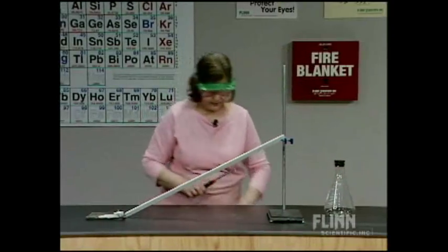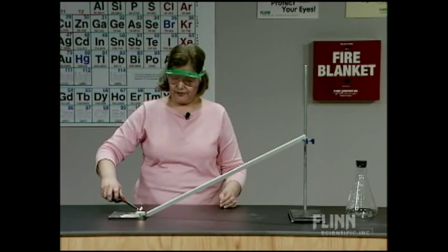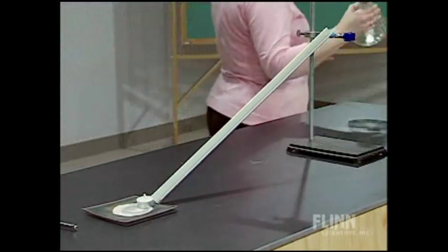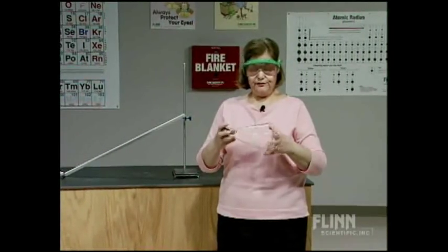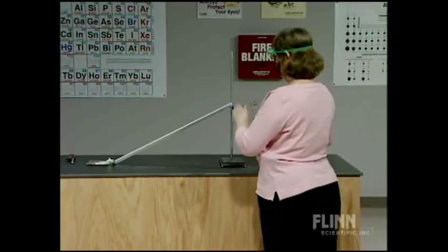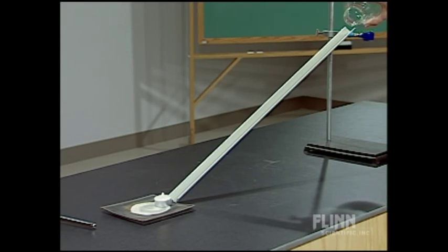In the meantime, having taken the hexane out, I'm going to light this candle that's at the bottom of this inverted V ramp. Then I'm going to move around to the front. I'm going to pour the vapor — and it's very important that I'm not going to pour the liquid. I wanted to fill the flask with the vapor, allowing the hexanes to evaporate. What I'm going to demonstrate when I pour it is what happens to the hexane vapor. I'll very gently pour and you should look at the candle and what happens when I pour that vapor down the ramp.